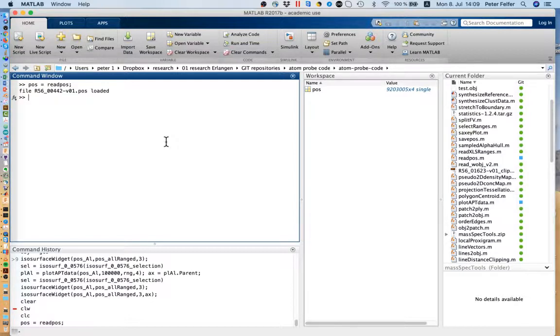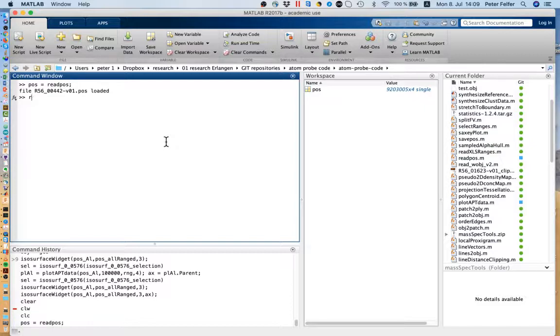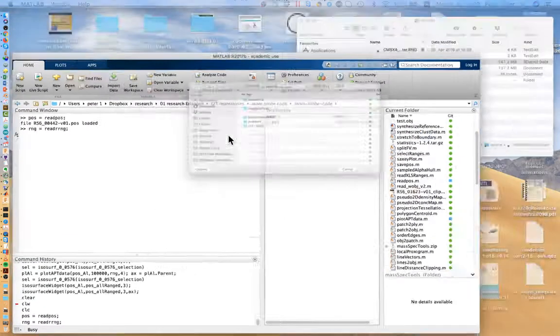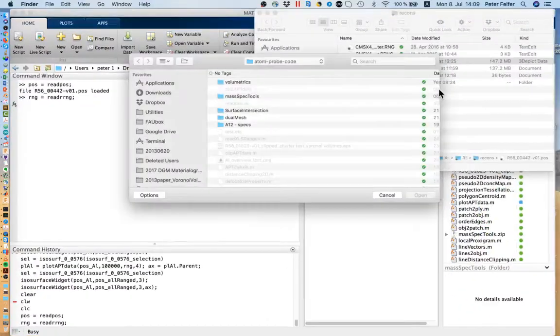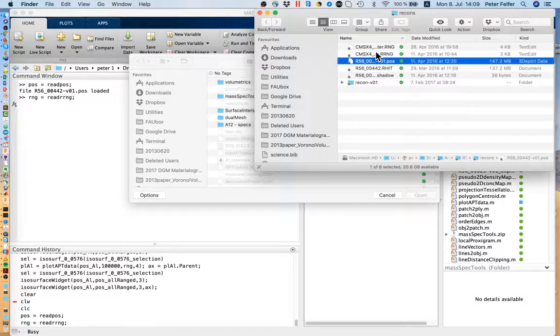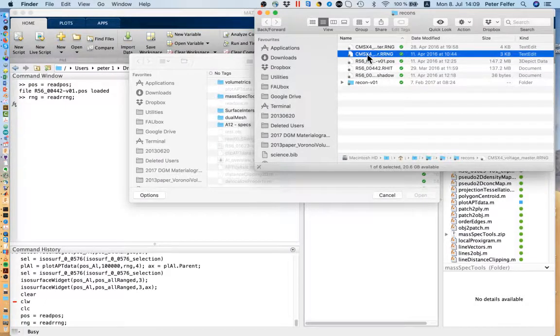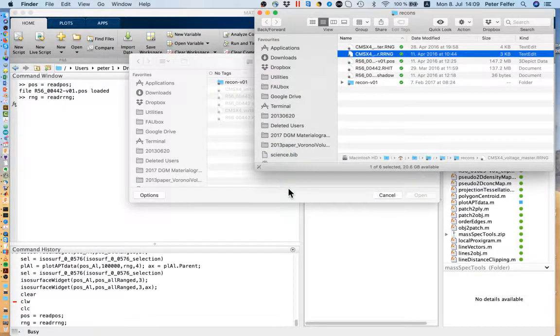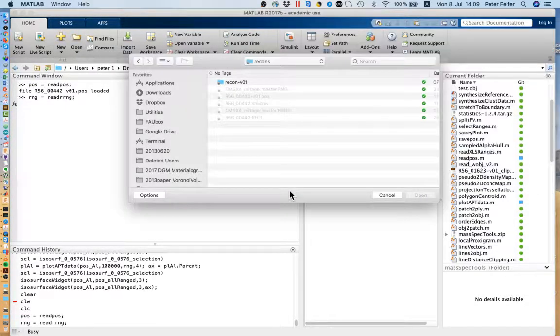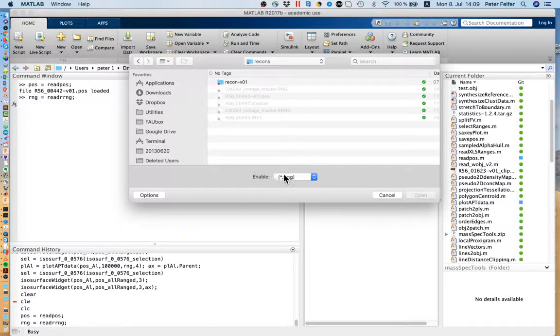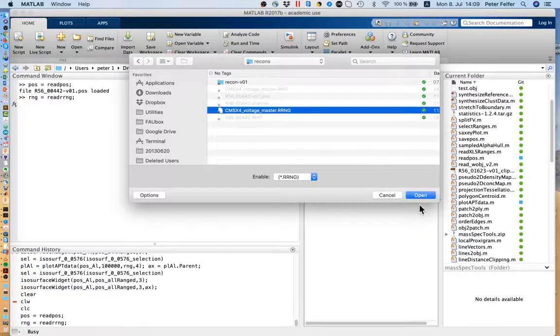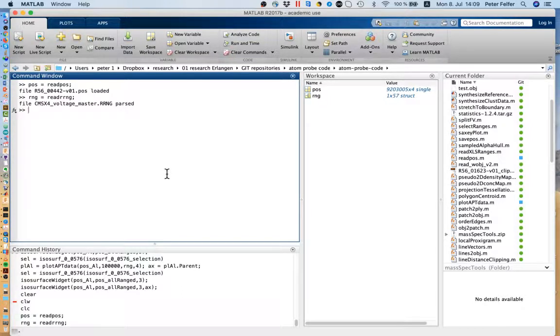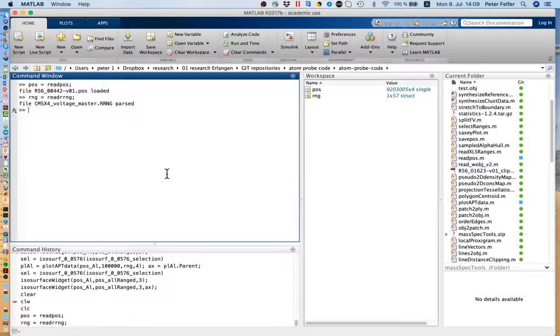Last time we already had the read range command which now allows you to read in an RRNG from Ivers data. And again we've got the issue that MATLAB is case sensitive, can't do much about that.